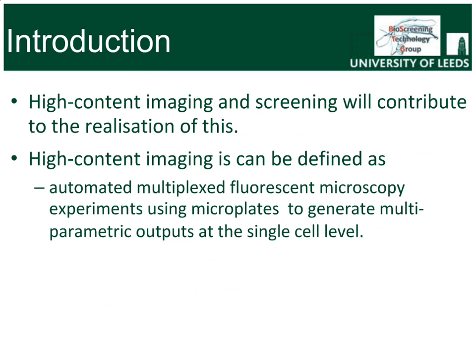The development of high-throughput fluorescent microscopy, called high-content imaging, due to the sheer volume of data or content that can be extracted from single cells and wells, is making this a reality. These systems are automated imaging platforms, usually with a minimum of 4 channels for different fluorophores, and permit the capture of several thousand images in short time frames. Thus, large compound libraries can be effectively screened using in vitro imaging approaches that may be more biologically relevant than some of the biochemical assays available.